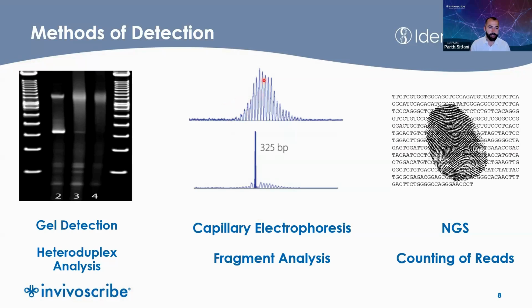And in a polyclonal cell population, we expect that distribution of lengths to be normally or bell-shaped distributed at a given average length. However, if B cell Y becomes overabundant, the peak representing the length of B cell Y should be higher and stand out from that normal bell-shaped curve. And you can see that here, this peak is significantly higher than what is in the background. And you can see the negative background is significantly different as well.